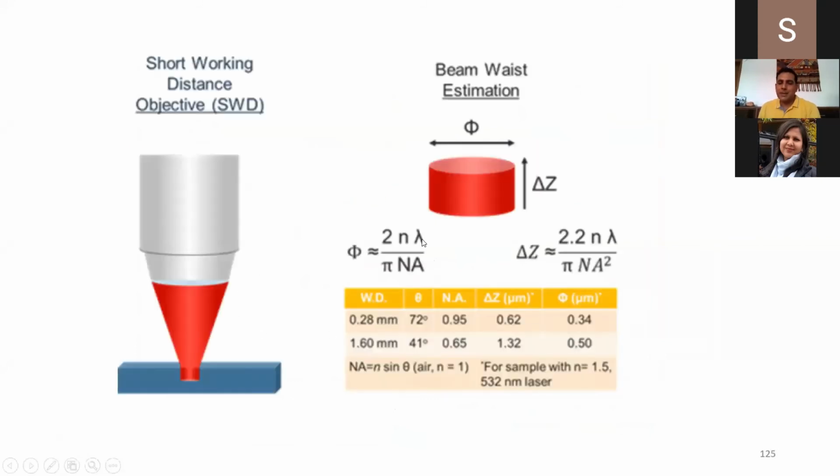The first part is the sample collection area, how broad the area should be. In the case of a solid, this phi value should be as low as possible, because in the case of a crystal, your intensity becomes too high, sometimes 45 lakh or so. So your equipment would become saturated in terms of peak height. So you have to minimize this window size.